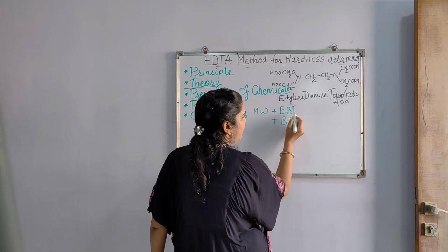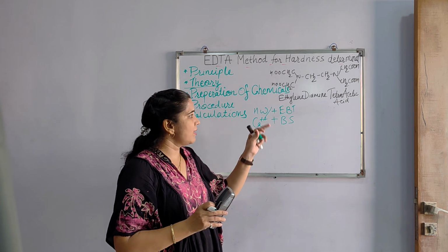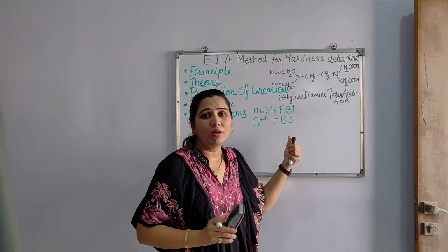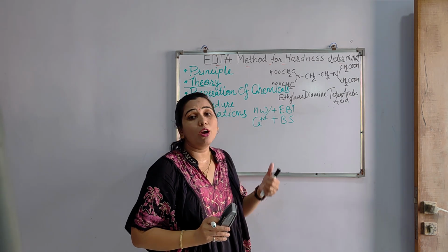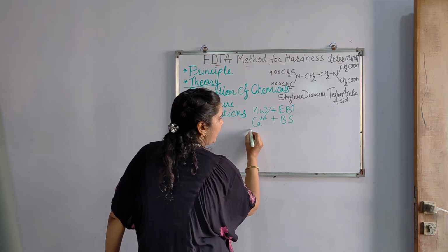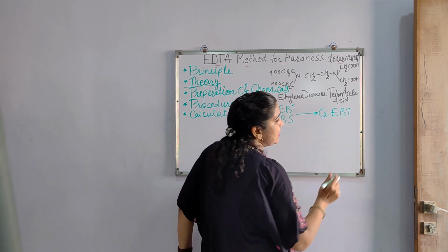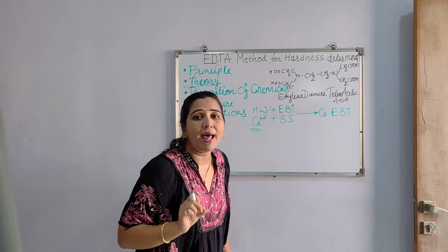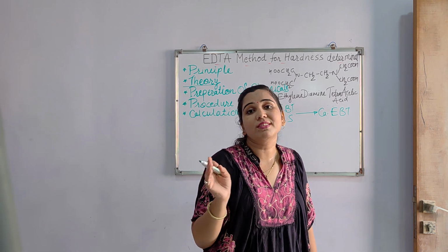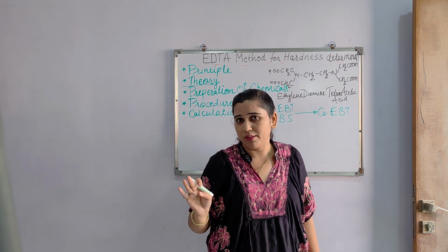Okay. So after addition of EBT and buffer solution, this hard water is having, let's just consider, Ca positive ion. Not H positive and OH negative will react with EBT or buffer solution, but there is a reaction of Ca or Mg type of ions, because they are there for the hardness cause. So this Ca positive ion reacts with EBT to form a Ca-EBT complex. Now this EBT is a dye, Eriochrome Black T. Its name includes black, but it is blue in color, and it shows a color change from wine red to blue.